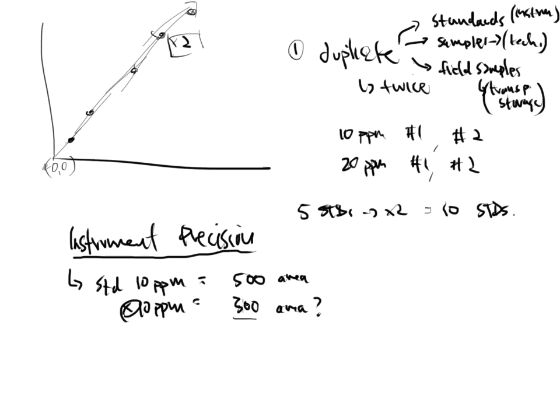I need to replace that instrument. I need to get a new one. I need to repair it. I need to perform some maintenance on it. I need to troubleshoot it. Something is going on with the piece of equipment.